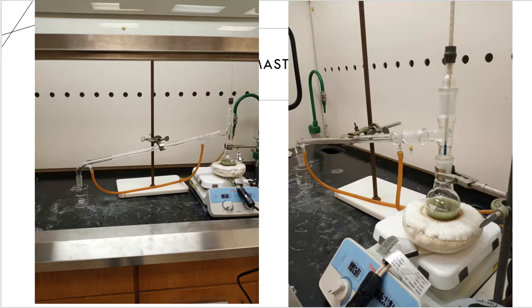That material went to a distillation setup. The laboratory technician did not use the Rotovap like I used. Instead, it was just a quick, simple addition of a sidearm flask that you're seeing here, and then a condenser tube to the left. It does the same thing that the rotary evaporator does, but it was more convenient for her to assemble this very quickly and start distilling it over. To the right-hand side, you see that the product here is more of a greenish color that she has ended up with. And then we're going to capture anything that comes over on the left-hand side.